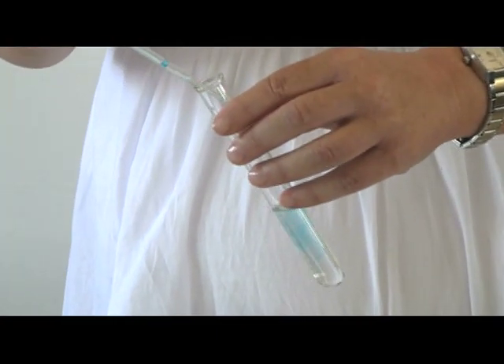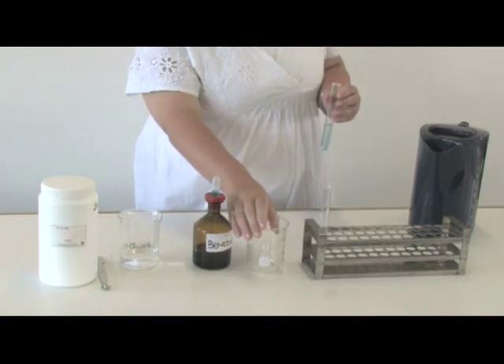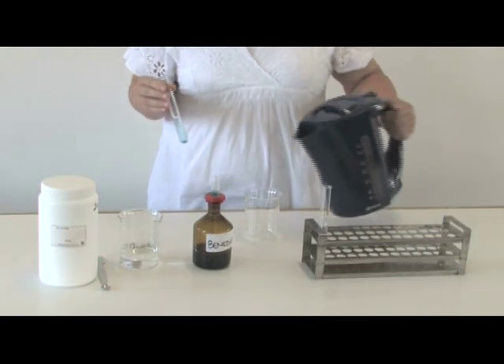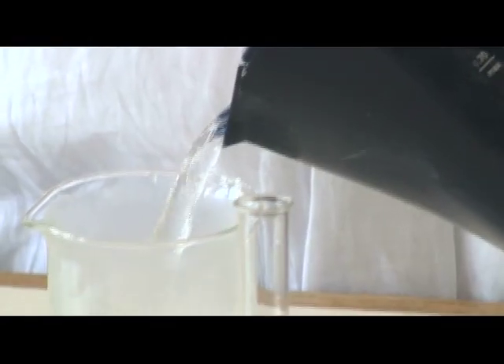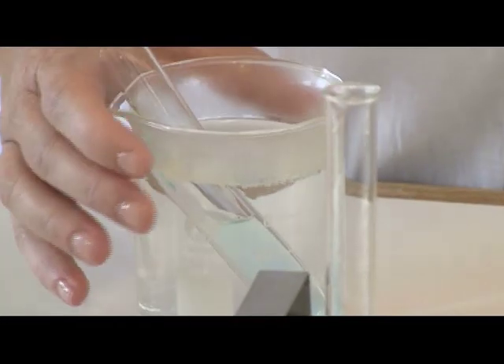Add 3 or 4 drops of Benedict's solution to the test tube and observe the color change. Then place the test tube into a beaker of boiling water and let it stand for about 5 minutes.